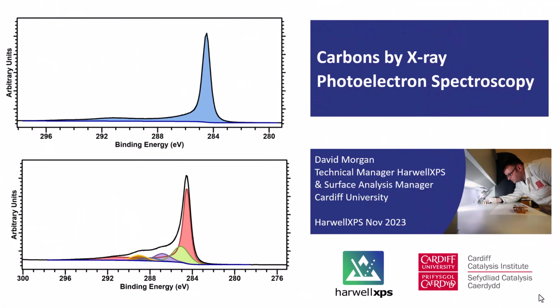So today we're going to talk about carbons by XPS. Now first I want to apologise, I can't be there in person today. I'm at a conference, but carbon is probably one of the simplest, most ubiquitous and equally the most infuriating core levels sometimes to analyse.